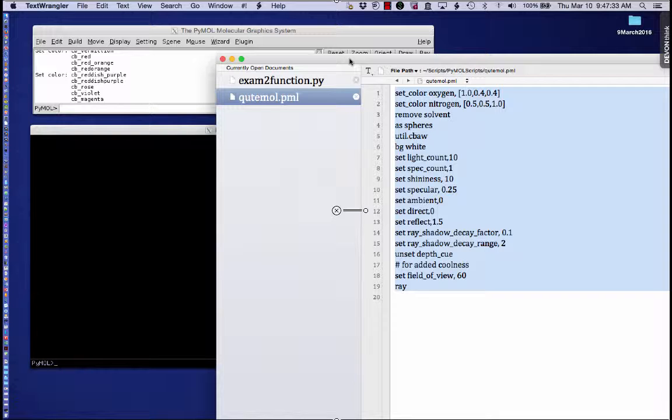While preparing to teach PyMOL to first-year graduate students a couple years ago, I found a simpler method. Scores of commands can be put on the command line in PyMOL if they're separated by semicolons. You can even add comment lines that start with a hash or pound sign. The comment lines are skipped over by PyMOL. These comment lines have to be flanked by semicolons.